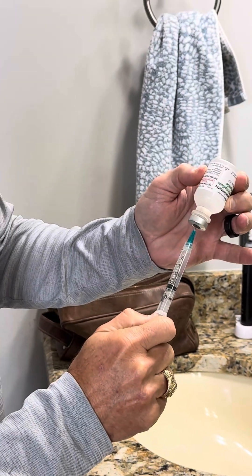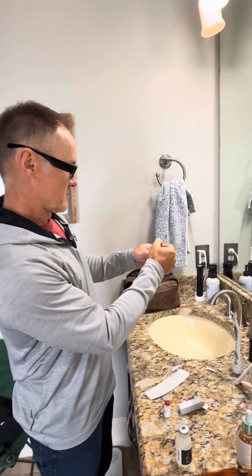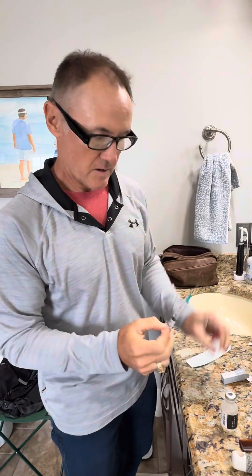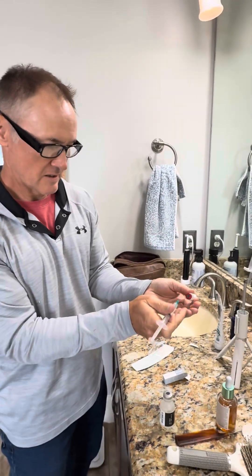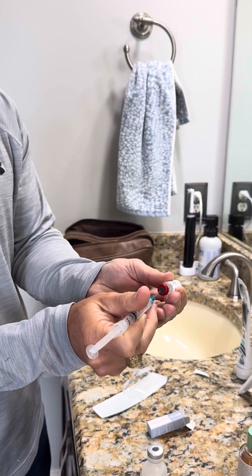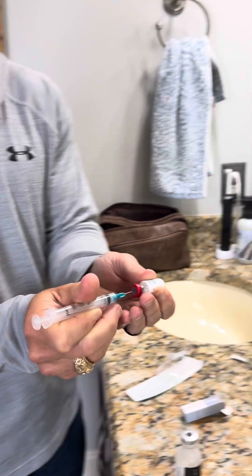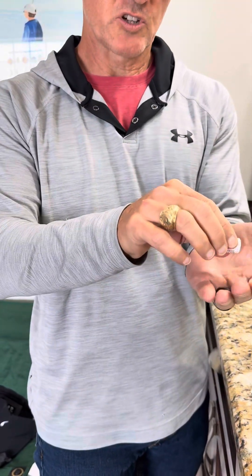I usually get a little bit more to get the bubbles out. Then I take the peptide, hold it just casually lateral, and insert the needle into the peptide in the middle there — it goes in under negative pressure. See that? So that's it, and now I don't even shake this.